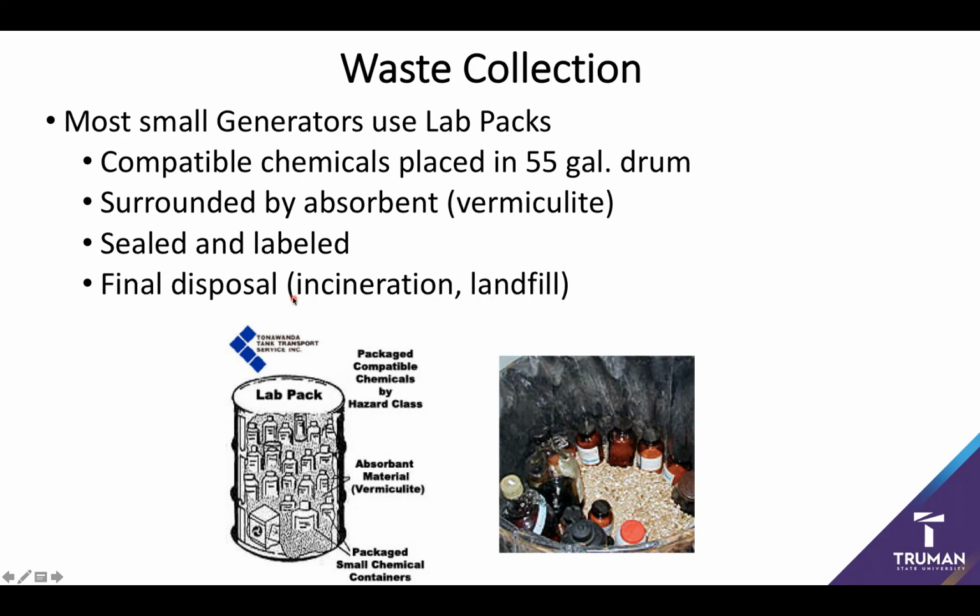Typically, this occurs either as incineration, specifically if you're talking about non-halogenated organic waste. But as soon as you're talking about halogens or heavy metals, that typically means a specialized landfill. One of the other important things that's worth noting is that when we do generate a lab pack, it's typically best procedure to separate them based on hazard type. So for example, I'm going to want to keep my oxidizing waste away from my organic waste in case something bad does happen. And again, this is what we use here at Truman.